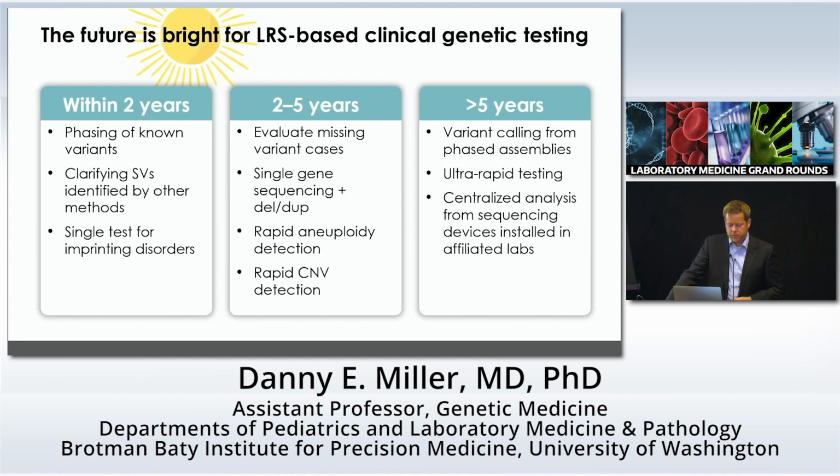So I do think the future is really bright for long-read sequencing in general, and then I think more specifically for long-read sequencing based clinical tests. I'm going to watch Kate while I say some of this to make sure she doesn't throw anything at me. What my hope is that within the next couple of years, we have a long-read sequencing based test that can be used to just phase known variants.